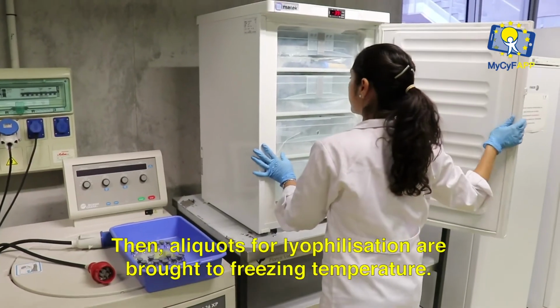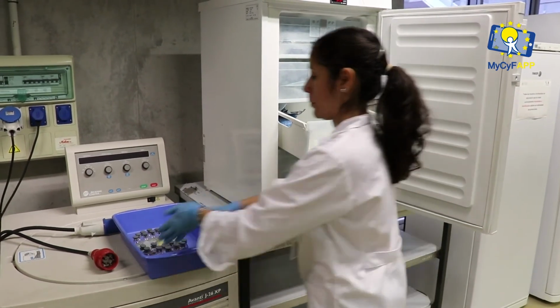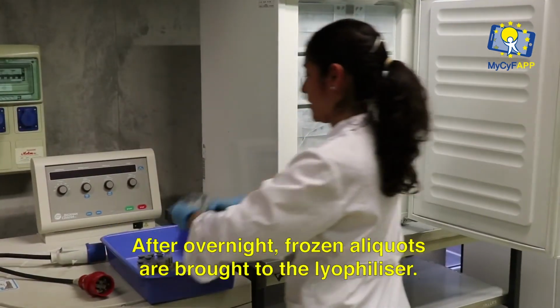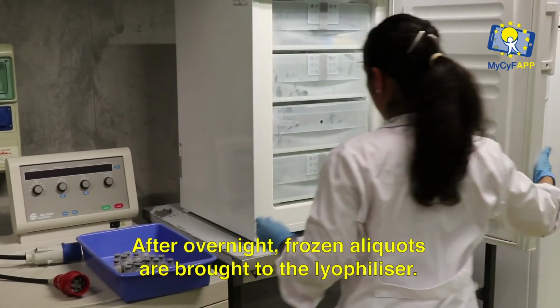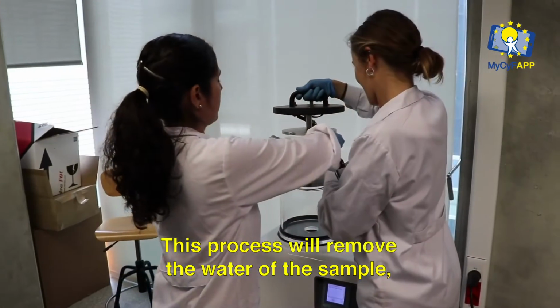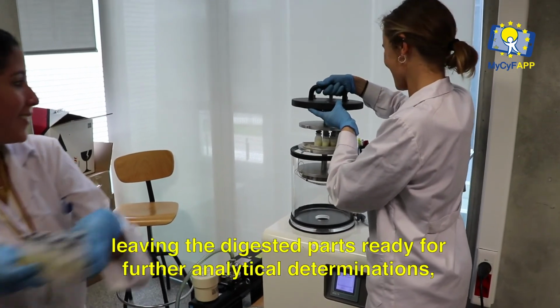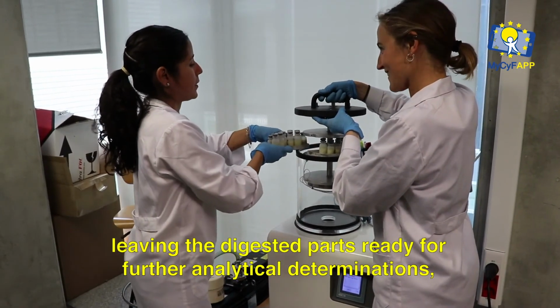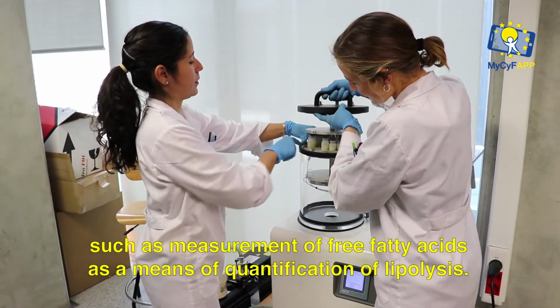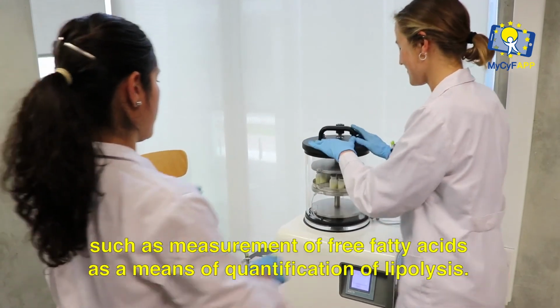Then, aliquots for lyophilization are brought to freezing temperature. After overnight, frozen aliquots are brought to the lyophilizer. This process will remove the water of the sample, leaving the digested parts ready for further analytical determinations, such as measurement of free fatty acids as a means of quantification of lipolysis.